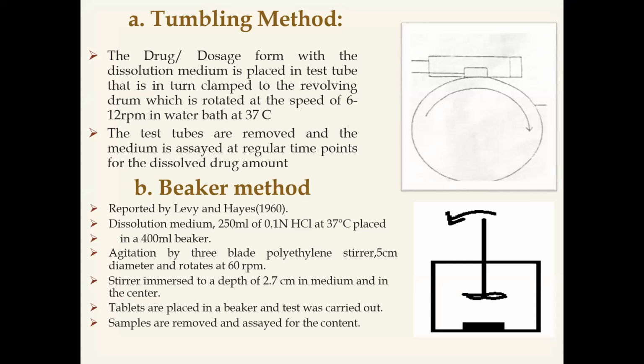So this consists of dissolution medium, 250 ml of 0.1 normal HCl, and a 400 ml beaker. This is the thermoregulated dissolution vessel.